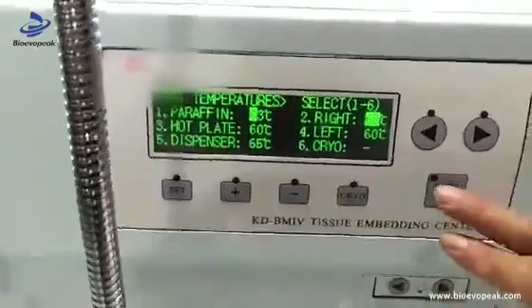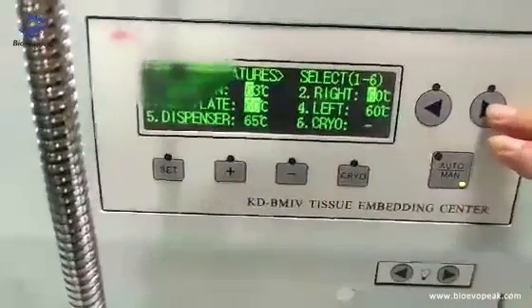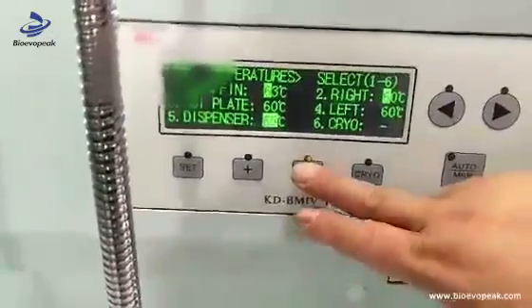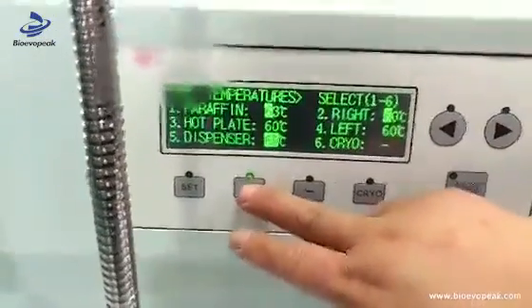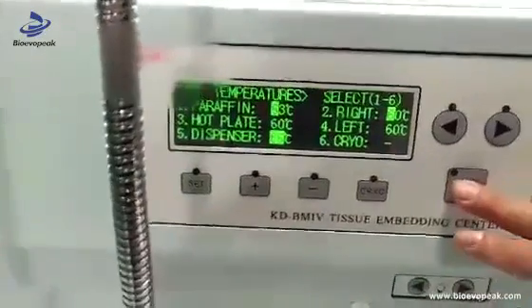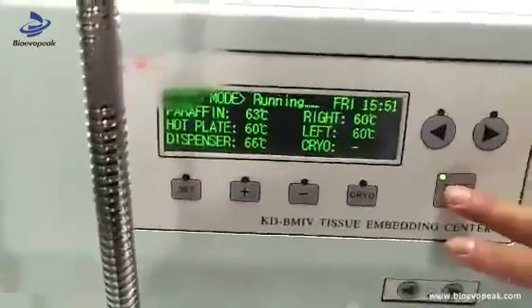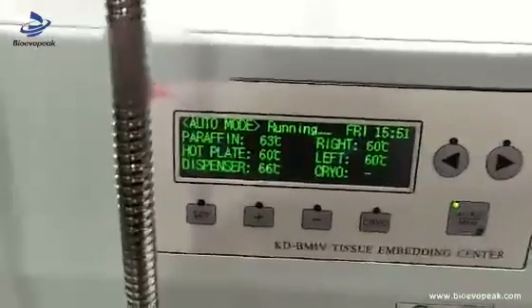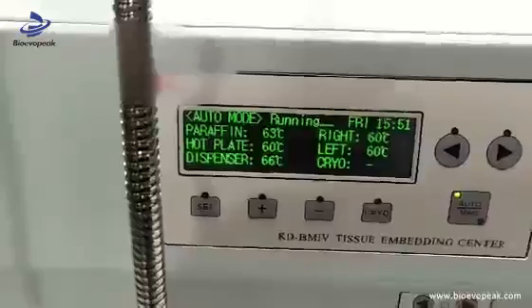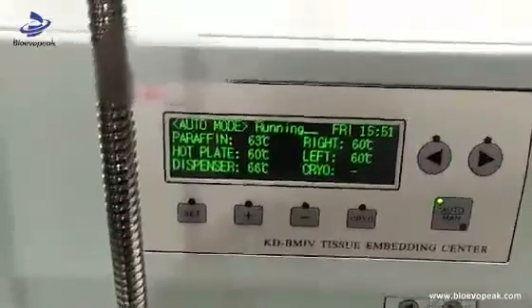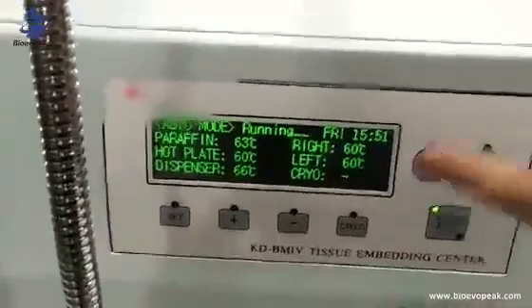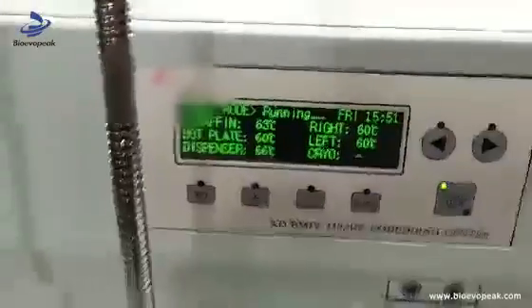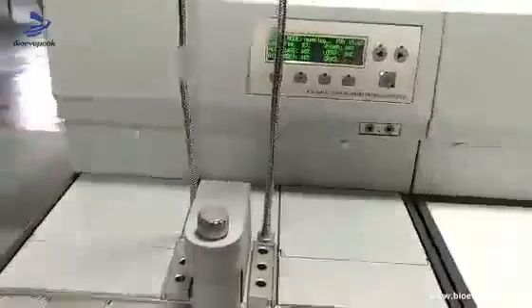Adjust the temperature by pressing the minus and increase keys, then go to the next part. Normally we set the temperature for each heating part to 55 to 60 degrees. After that, press this key to let the machine go to its heating mode. Now the machine is heating itself.